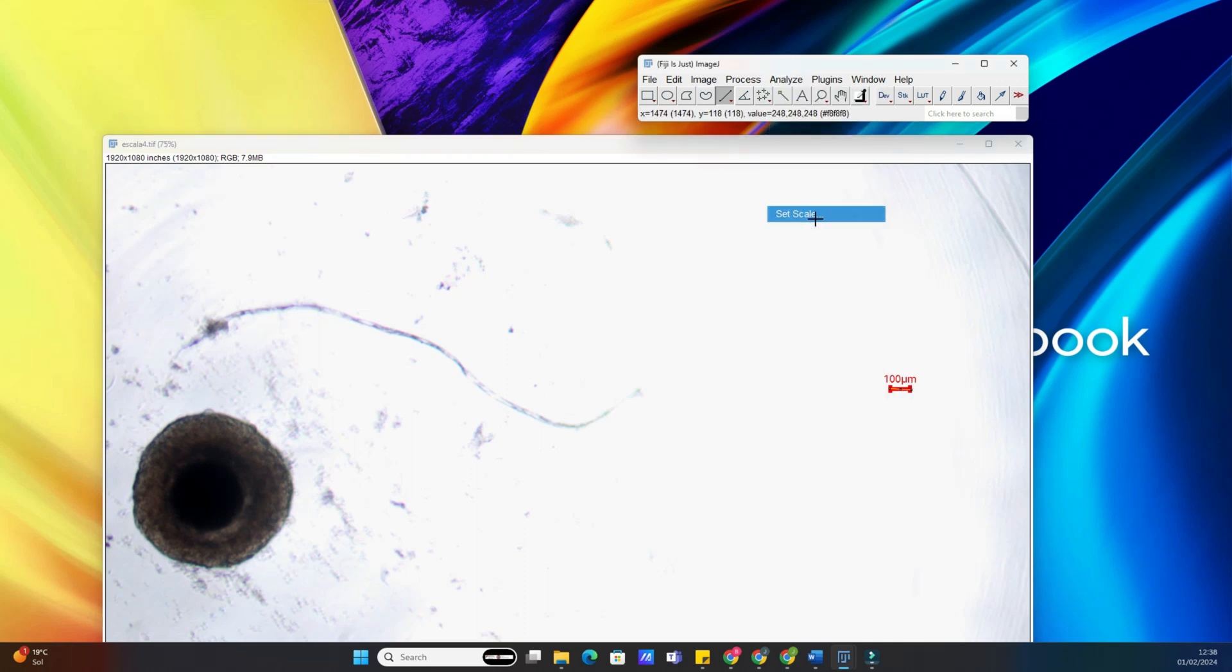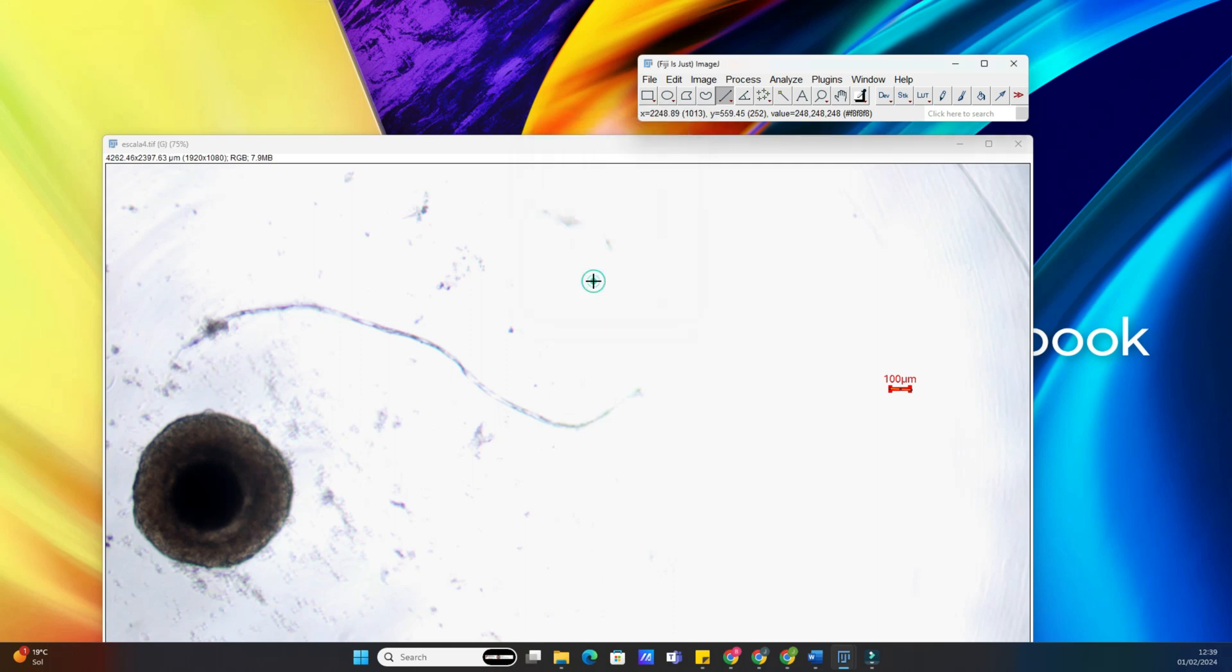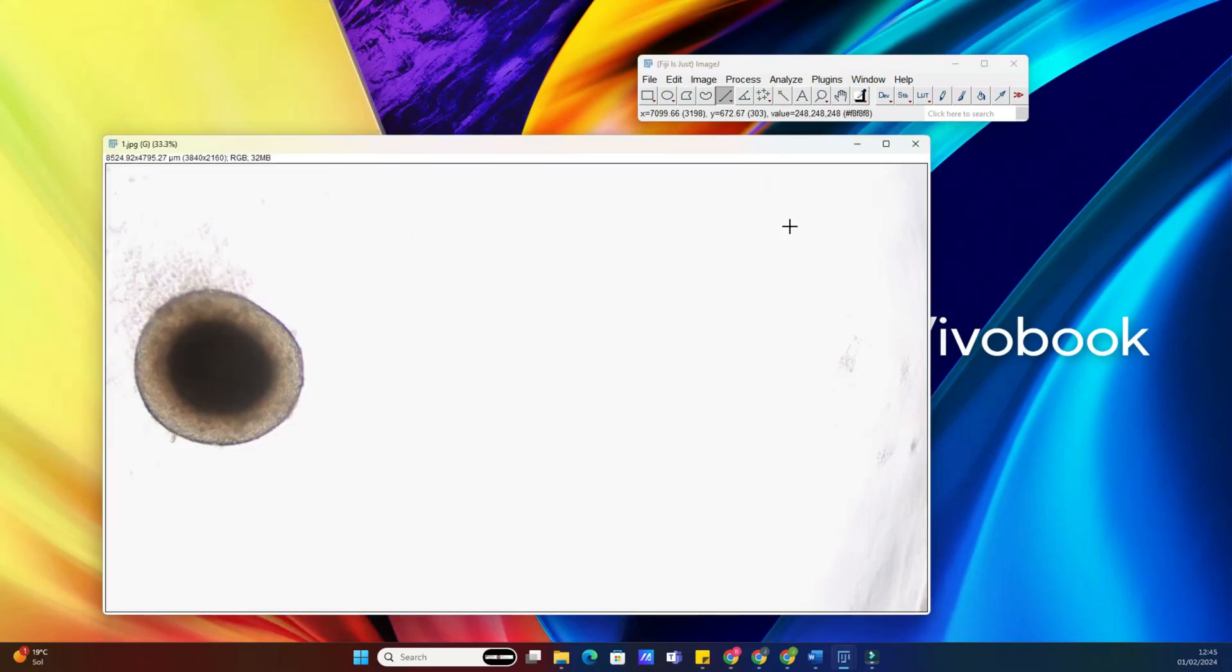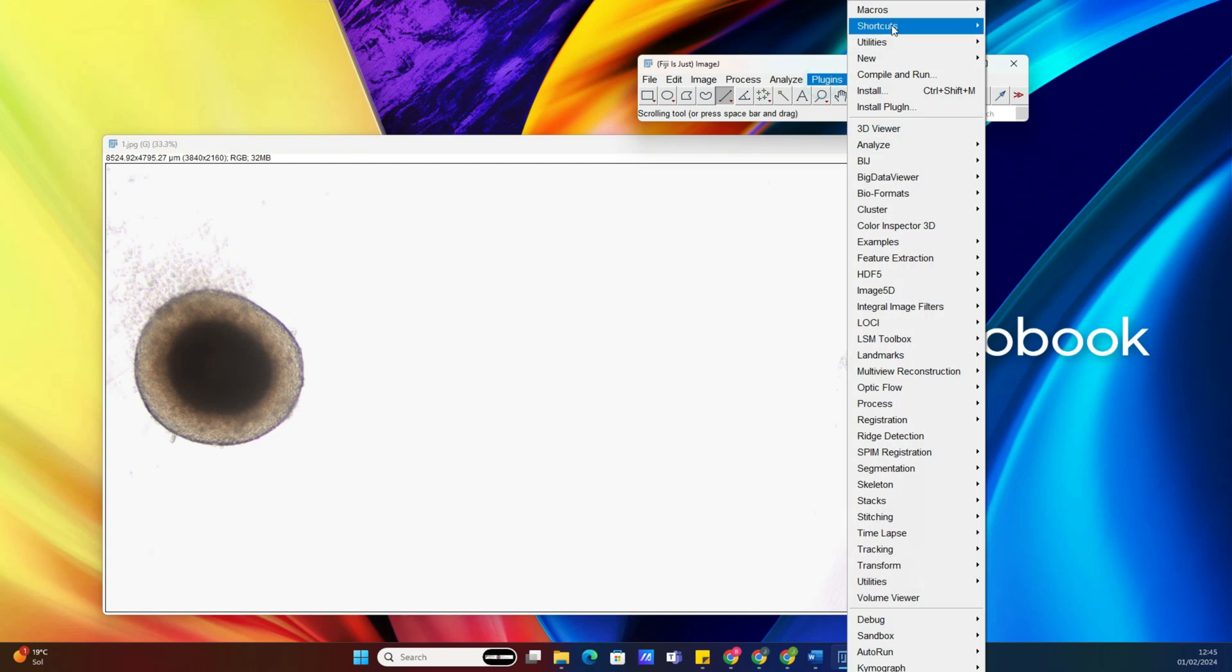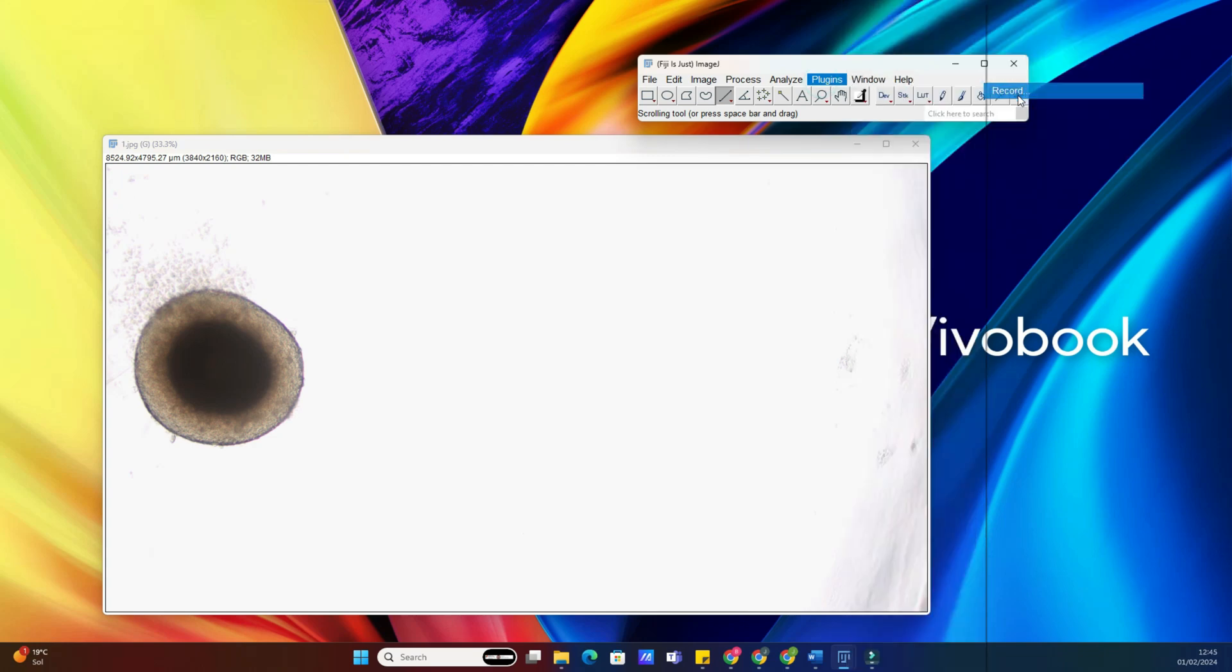The first step is to have all your images ready. Open ImageJ and let's import a sample image. Organize multiple images in a dedicated folder to make your life easier. ImageJ will be more efficient if all the images are in one place. Also, create an empty output folder.